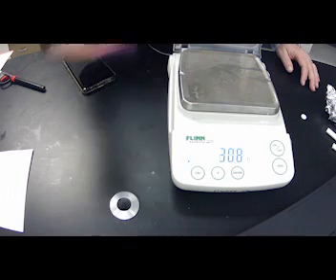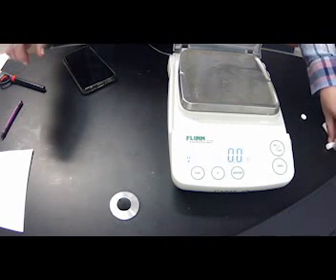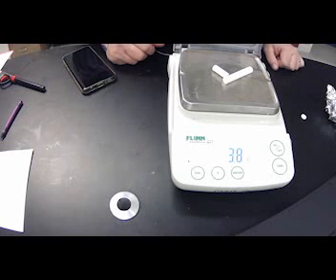Okay. All right. The next one we're going to do is chalk. Okay. I'm going to use these two pieces. We're going to weigh that first. And the mass before is 3.8 grams.